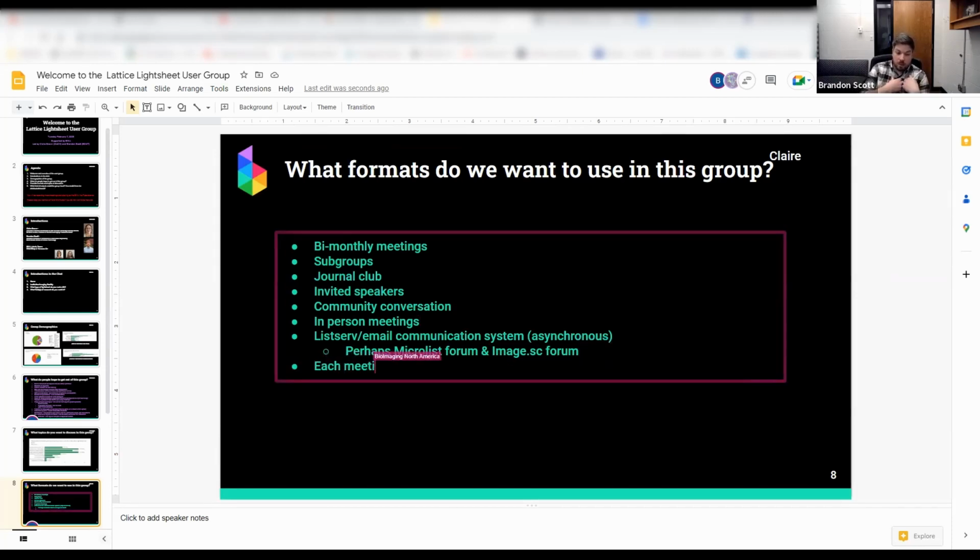And that would excite me, right? If we had one topic, this is the thing we're going to talk about, rather than this nebulous, we're going to talk about everything and keep it very surface level. But if we can integrate one idea that came to mind when we were talking about these standard operating procedures is like, we all should or do measure our laser power at the back focal plane, right? Or near the back focal plane.